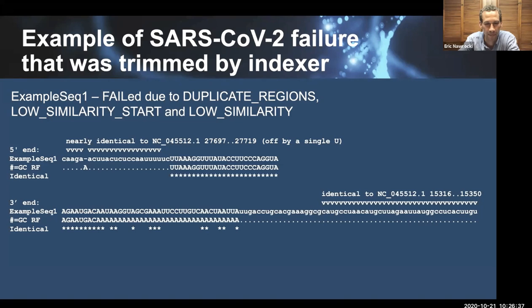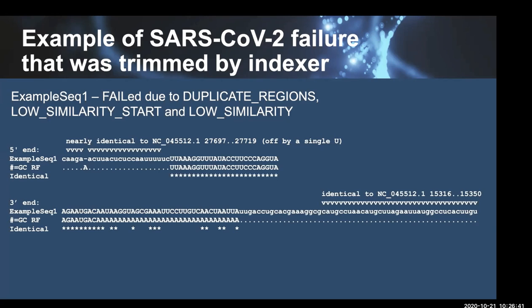That's fine. I just ran VADR for the first time this morning, so this is fresh on my mind, and it's great. When I ran it, it produced that table file, which means I could take my genome assembly and upload that to GenBank with those annotations. Is it possible that those artificial annotations could make their way to GenBank just by what my workflow was?